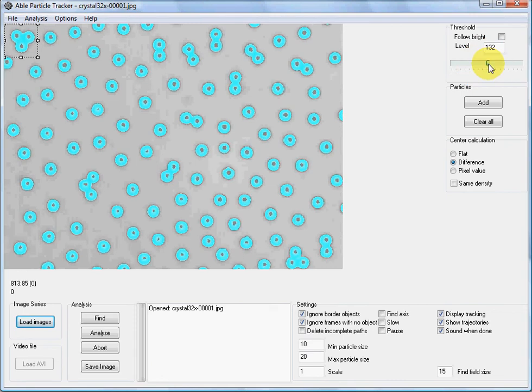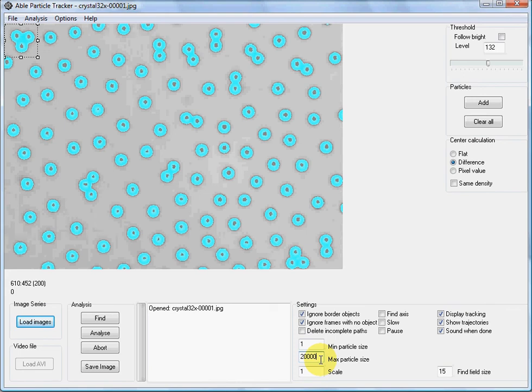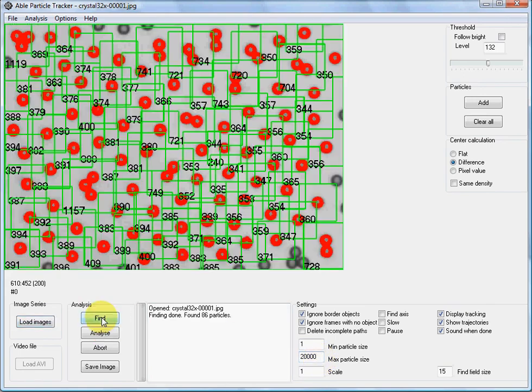Okay, that might do. We don't know anything about the size of particles, so let's enter 1 for minimum particle size and 20,000 pixels for maximum particle size and use the find button.